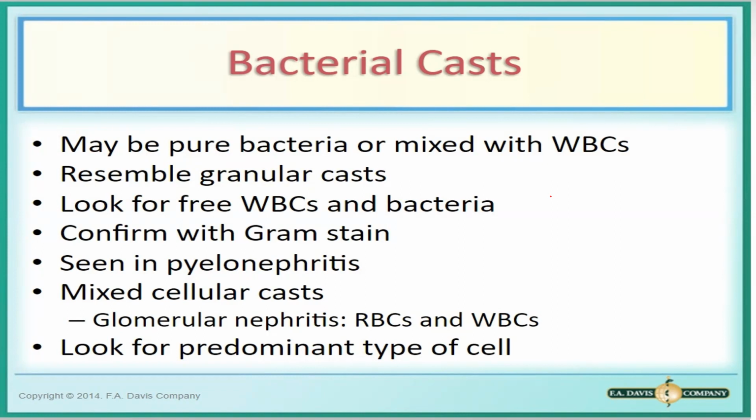When you say pyelonephritis kasi, yung infection is up within the tubules na. Okay? So, you can see, possible, you can see bacterial cast. Look for predominant type of cell. It is neutrophil ba, eosinophil ba, lymphocyte. If neutrophil, alam nyo naman yung neutrophil, di ba? Kung para saan. Eosinophil, di ba, for transplant rejection. Lymphocyte also for transplant rejection. So you can know the type of cause wala ng increase ng WBC.